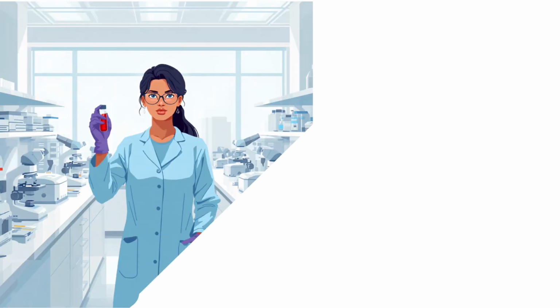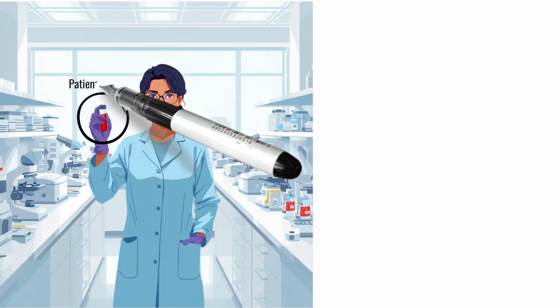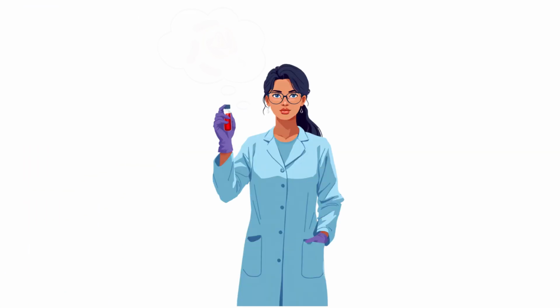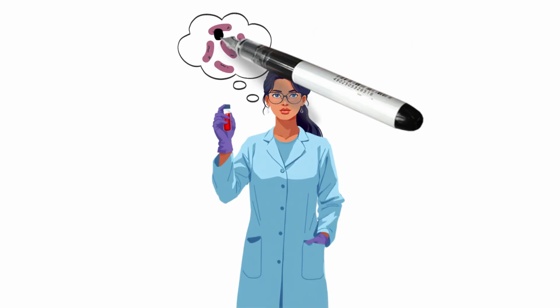Imagine you're working in a clinical microbiology lab and a sample arrives from a patient with a suspected bacterial infection. Before you can identify the species, before you choose the right antibiotic, you need to answer a more basic question. What kind of bacteria are you dealing with?